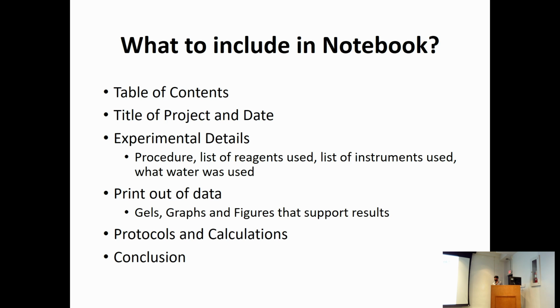So the major thing I can think of in this part is, if you have only one instrument, that's fine, you have to use it every time. But think about if you have multiple instruments. For example, you have 3 different UVs in the lab, labeled 1, 2, and 3. Then on a day, you are using the second instrument to take a measurement. But after a couple of days you get to know that on that day it was broken.